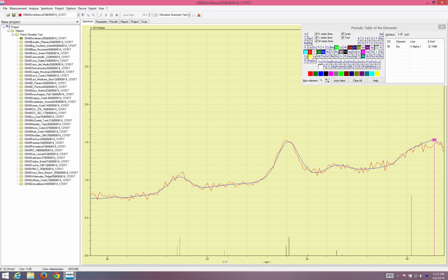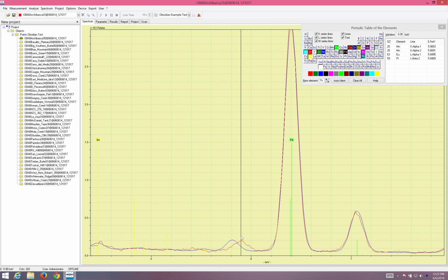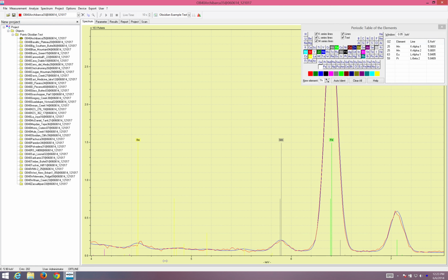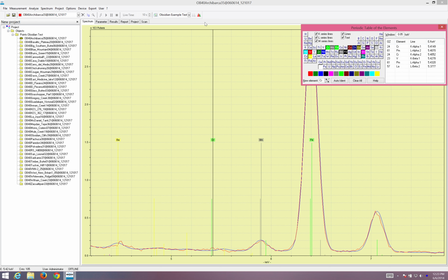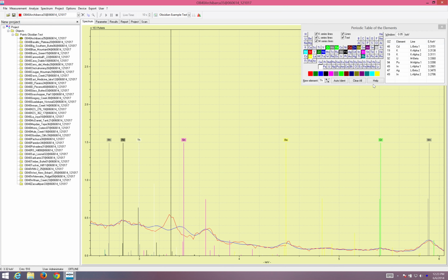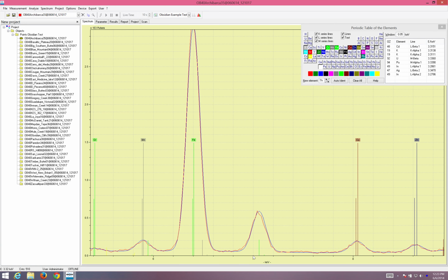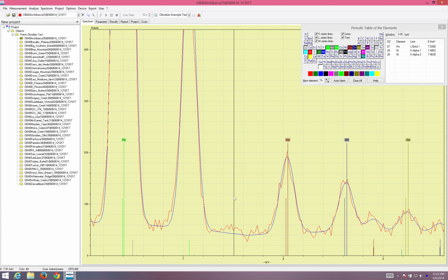So I'll now go back, double check, and make sure I get the light elements as well. Here we have manganese. Here, just a little bit of chrome. Here, I have a potassium line, but over here, because I used the green filter for this data collection, my sensitivity to light elements is not very high. But in any case, I look at this and I see a spectrum that's broadly working. I see potentially one element, nickel, just about at the limit of detection.